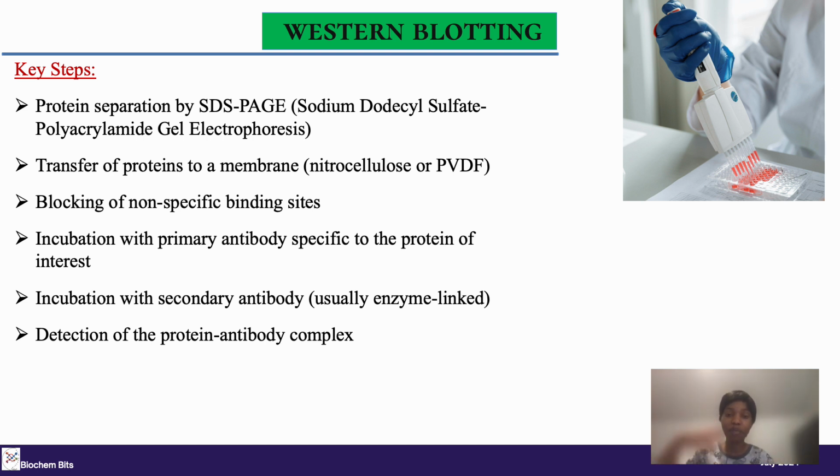So when your secondary antibody binds with the primary antibody that has already bound with the protein, look at it like this. You want to make a sandwich: you have the bread on the bottom, you have your beef, and some vegetables put on it, and you now have the upper bread to cover it. So it looks somewhat like that. It's more like a sandwich system.